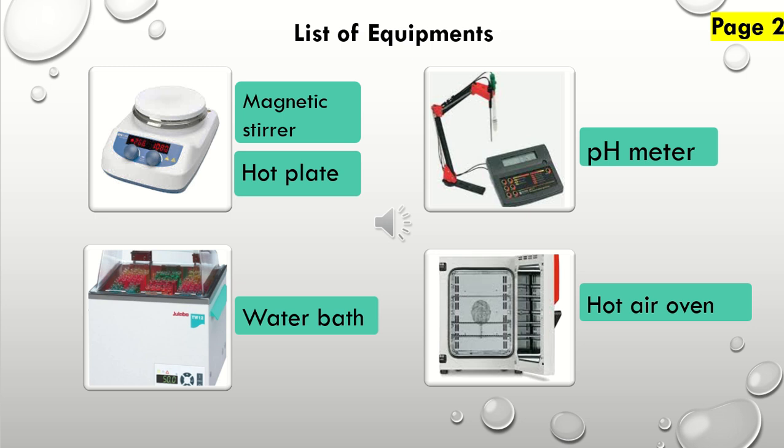And the water bath is for maintenance of media; you may place it overnight in this water bath for maintenance of temperature that is recommended by most of the ISO methods. Just like 44 to 47 degrees, this temperature is recommended by the ISO method. Then we will use this water bath and the hot air oven. We normally use this one for sterilization of glasswares, and also when we wash them, we need to open it so that any water residues will be removed from our glasswares.